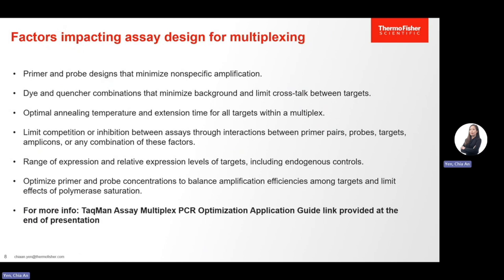This could arise from increased interaction between different assay sequences and/or templates within a single reaction. Then we touched a little bit on the reporter dye and quenchers. Specific pairings may help minimize background and limit crosstalk between targets.